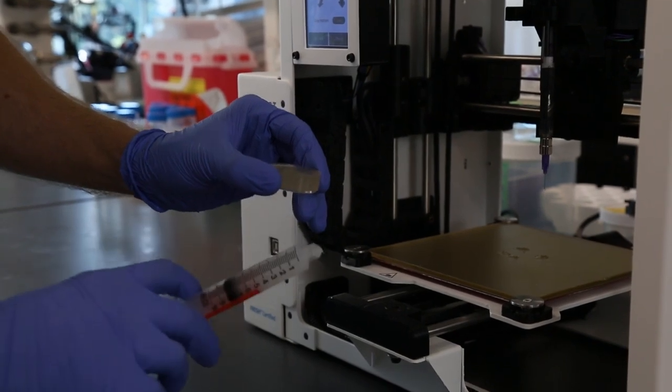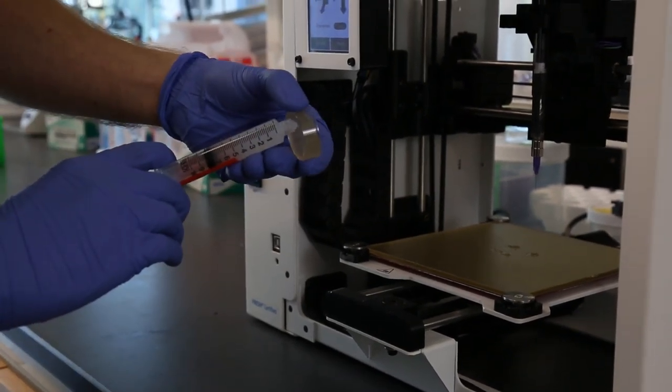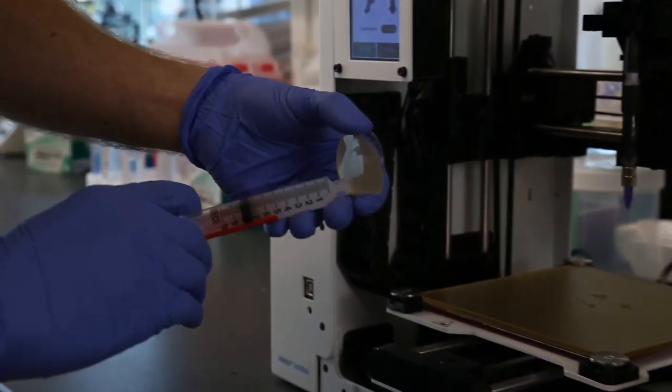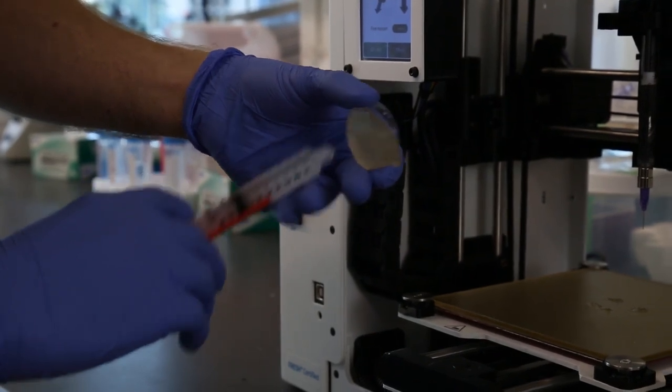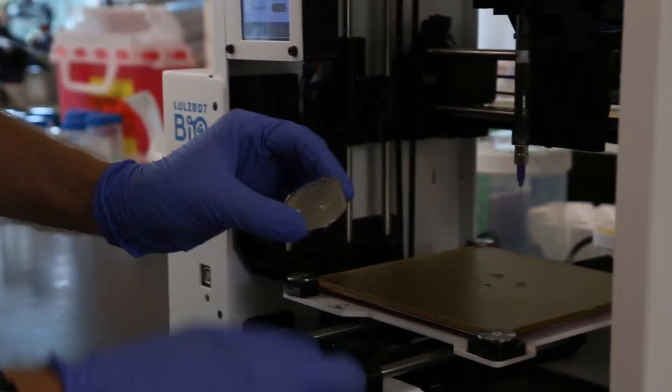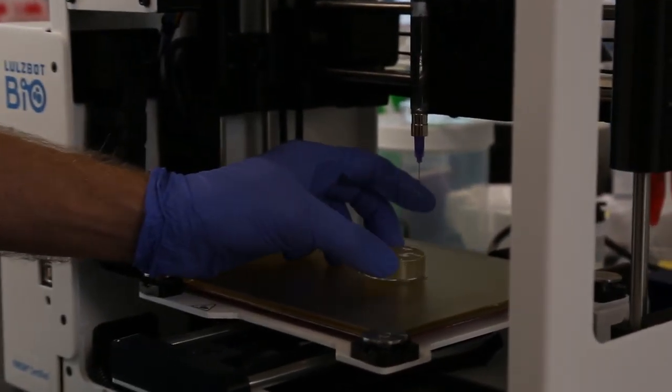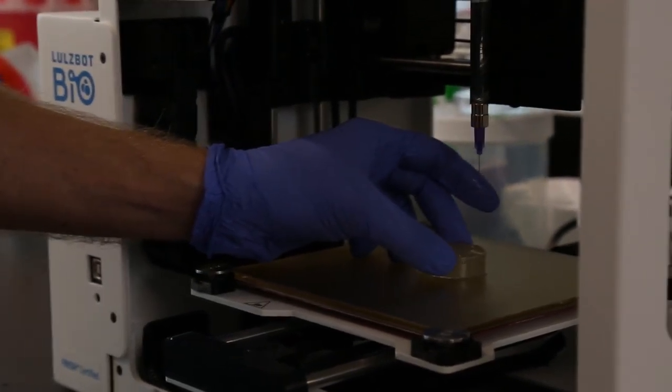I'm gonna add a little bit of vacuum grease, which is from Dow Corning. I like to put three little dollops on here, and all this does is just ensure that nothing is going to be moving around on the print bed during the process. Then just place that on the print bed.